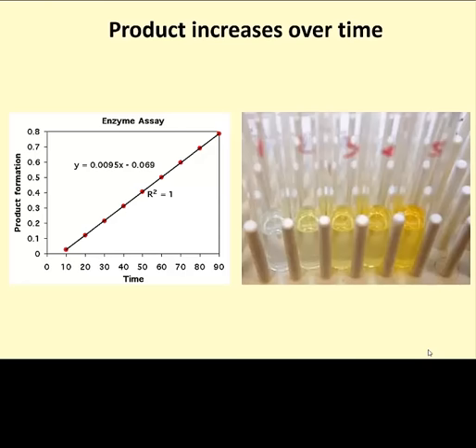In the actual experiment, you will break the cells open with chloroform to stop the gene expression at an exact time point, and you will stop the enzyme reaction in the activity assay by changing the pH. Since there are several time points you need to keep track of during the experiment, make sure not to confuse the bacterial incubation time with the time used in the activity assay, which is a common mistake students can make.